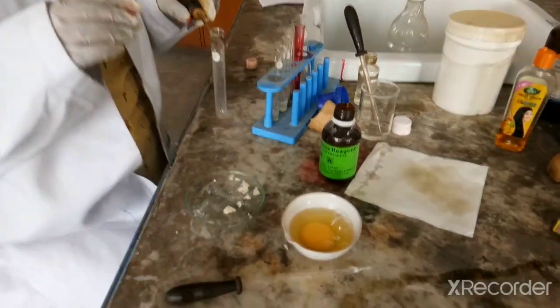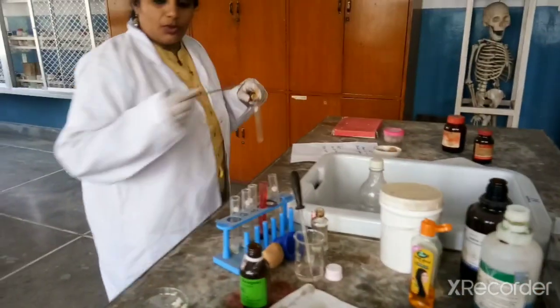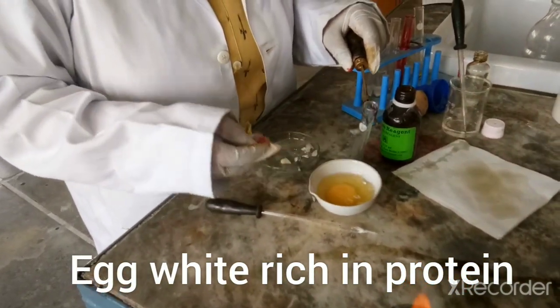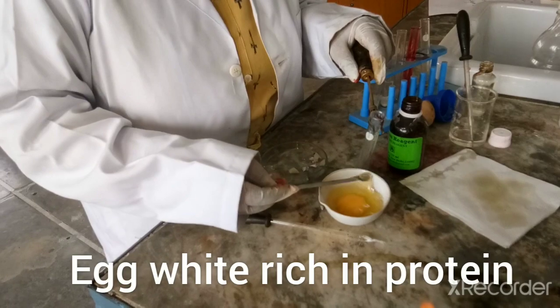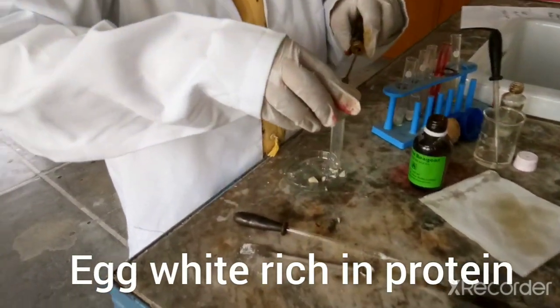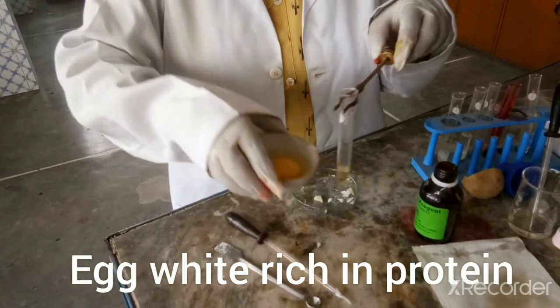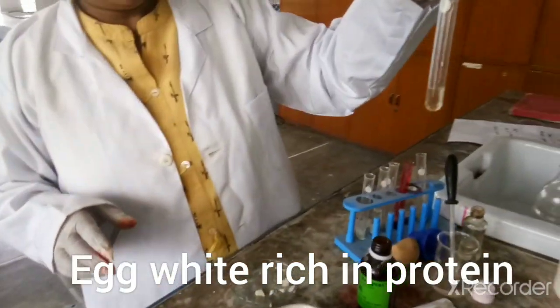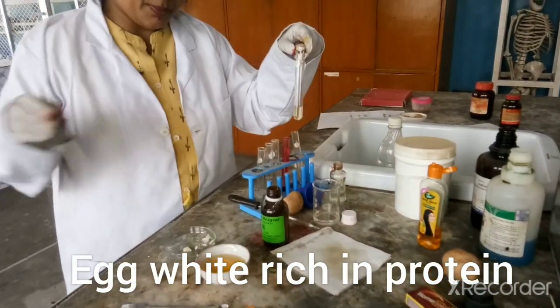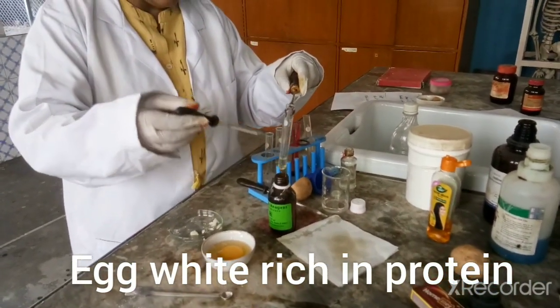It is difficult to take from the test tube so we will take it with a spatula. It is very dense and sticky so it is a little difficult to pour into the test tube. Be very careful — you are supposed to take only the white part, not the yellow part at all. Now we have taken the white part of the egg. We will take another stopper and from that we will add a few drops of Millon's reagent.